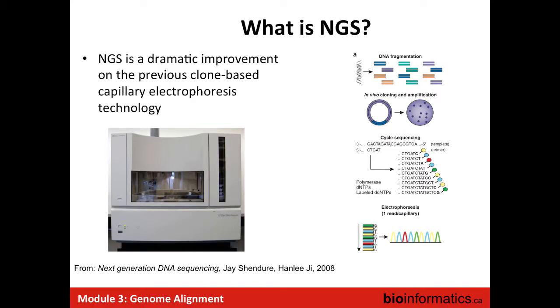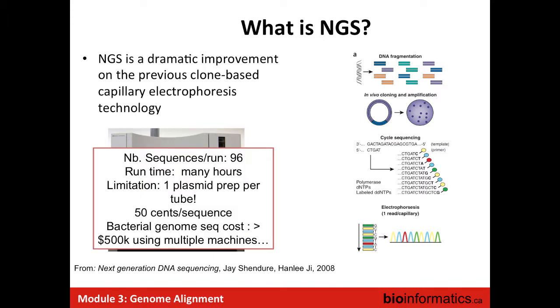So here you have already seen that. It's just an improvement in terms of technologies, where before we did hundreds of sequences at the same time, now we do millions of sequences at the same time.